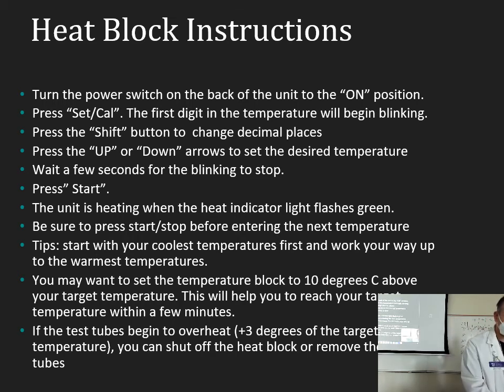We have a lot of tips in the manual today. It's going to be important that you check out pages 42 and 43 and read through those while you're planning what you're doing. There's a place for a hypothesis, etc. as well.